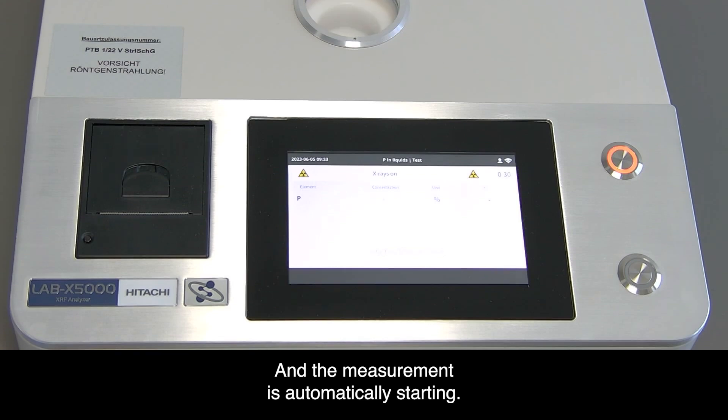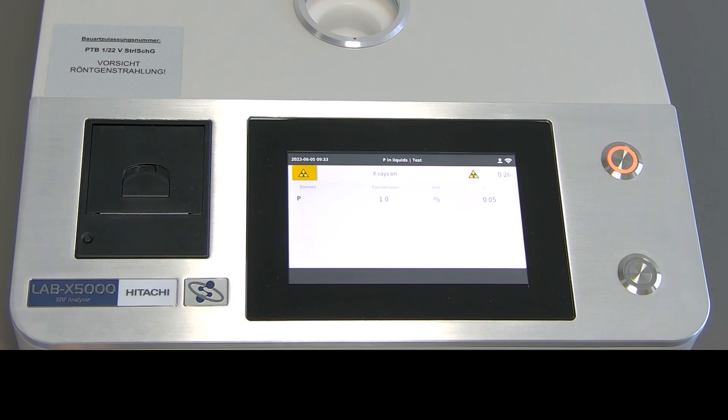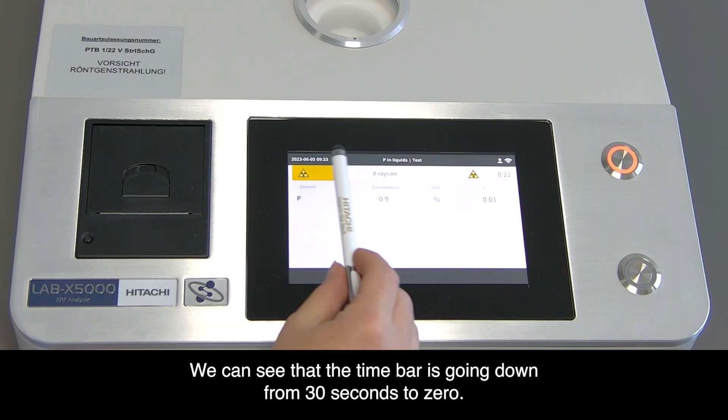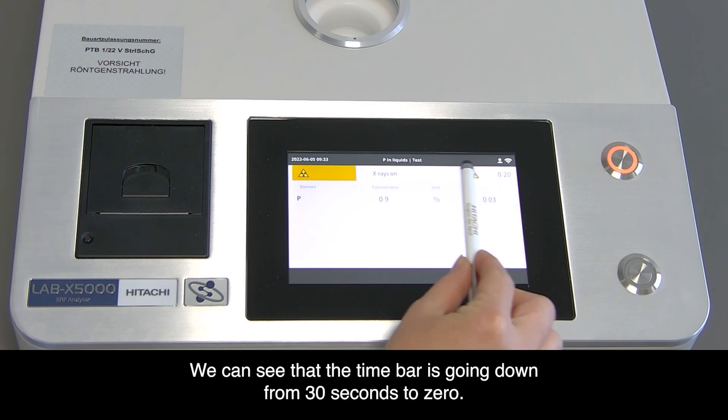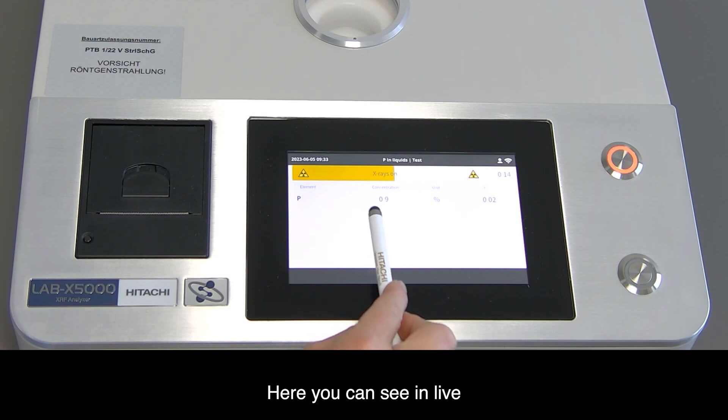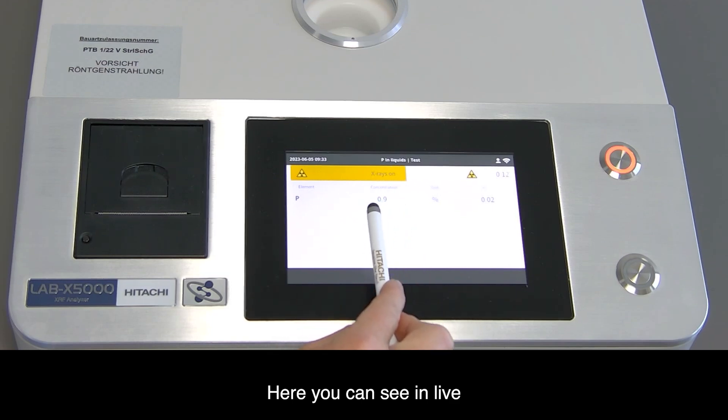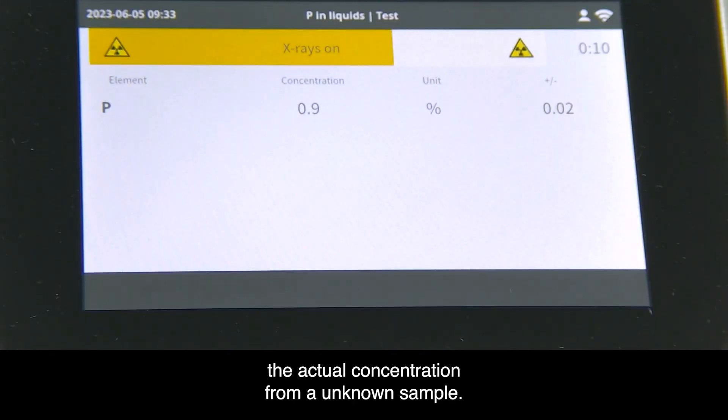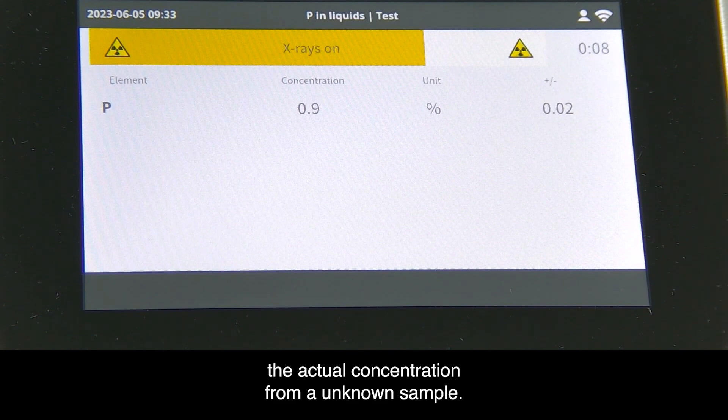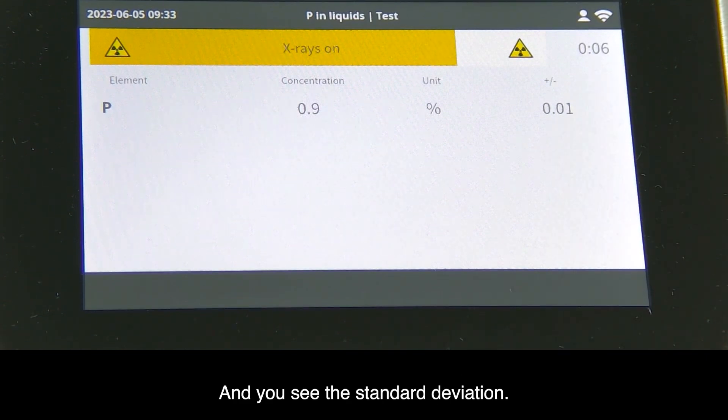The measurement is automatically starting. We can see the time bar going down from 30 seconds to zero. Here you can see live the actual concentration from our unknown sample and the standard deviation.